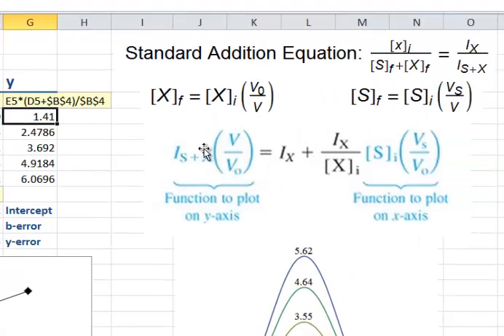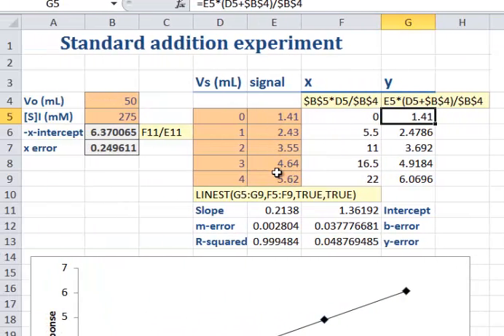Likewise, we need to come up with this expression for the Y values. The intensity of the signal with the standard added is our original data that we recorded from our instrument, and that's in our column E. Then we've got D5 plus B4. D5 is the amount of stock that we've added, and we're adding to that the total volume. So this value here should always be equal to or larger than the initial value, 50 and higher. And then we divide that by the original value, which was B4. Remember that I'm using dollar signs here to keep values constant, so that when I copied the equations down, they would propagate appropriately. So that's how I get my X and my Y data.